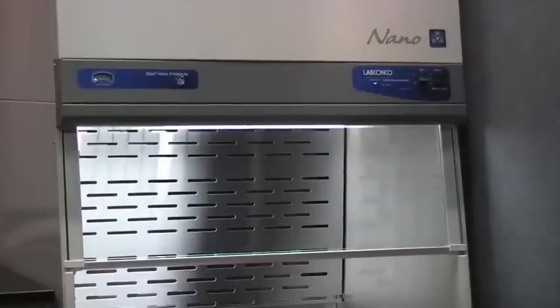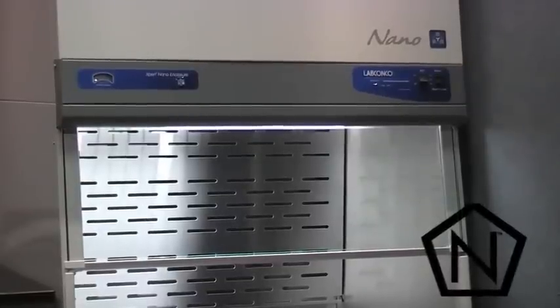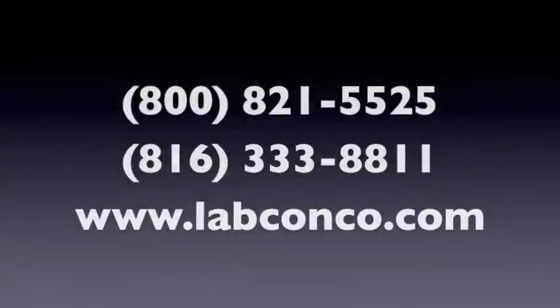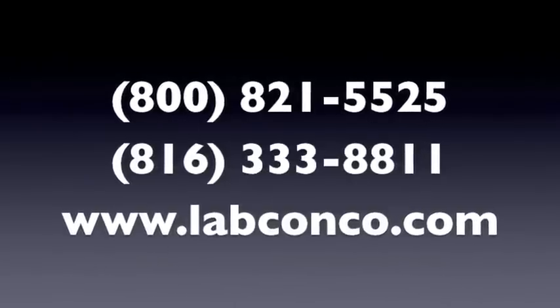The Expert Nano is the first and only enclosure to be validated for nanomaterial containment, as tested by NanoSafe Incorporated. For further information, please contact LabConco or visit labconco.com.